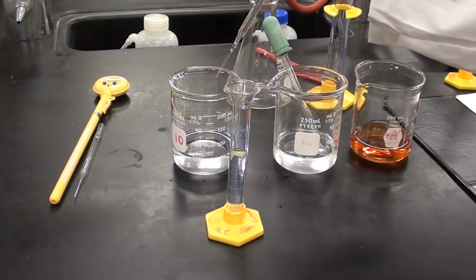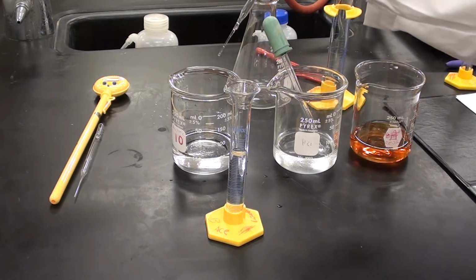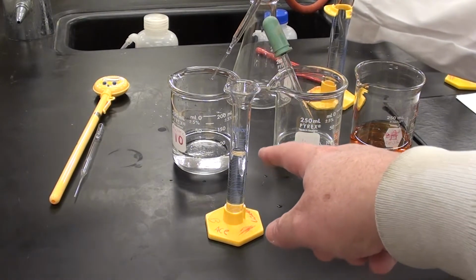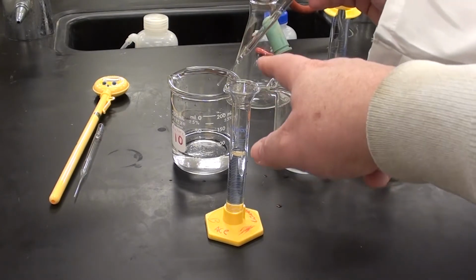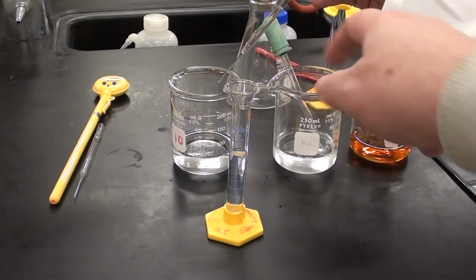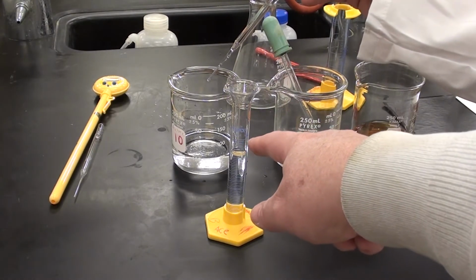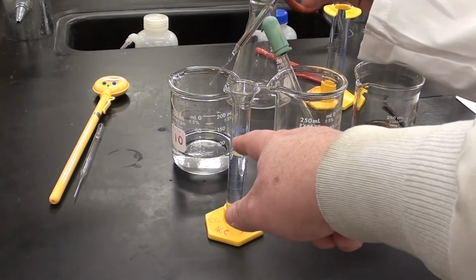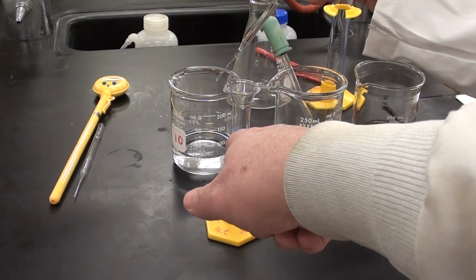So what I'm going to show you here is how to measure out the acetone for the first trial. We've already poured in a bit of acetone, and it's up to probably about the 8 ml mark. Once we get to about 8 or 9 mL, it's best to use a pipette to fill it the rest of the way. Now when you're doing this, you want it to come up to the meniscus. That U shape that we get for the liquid has to be on the 10 mark.